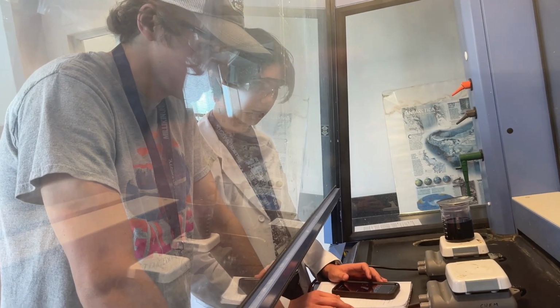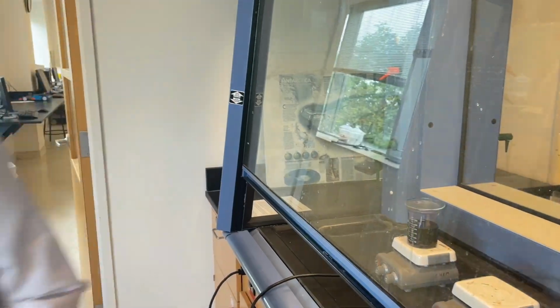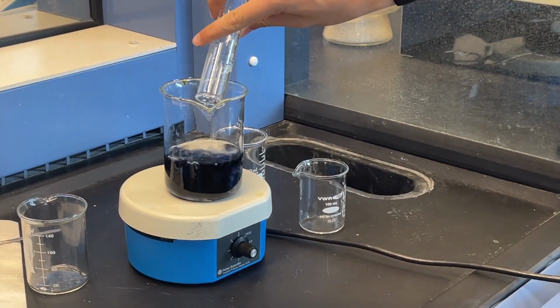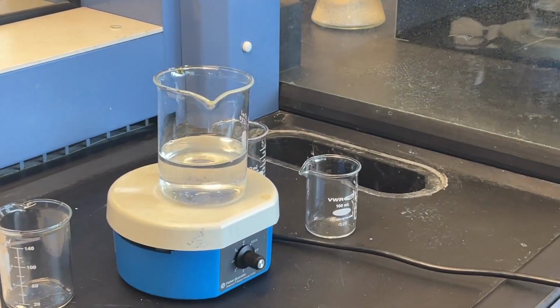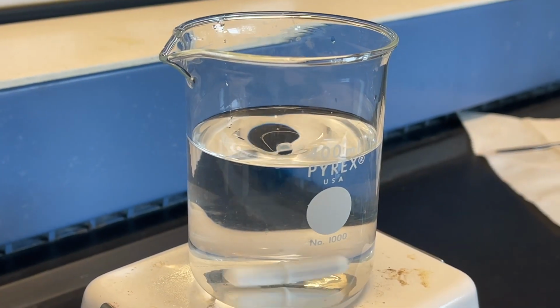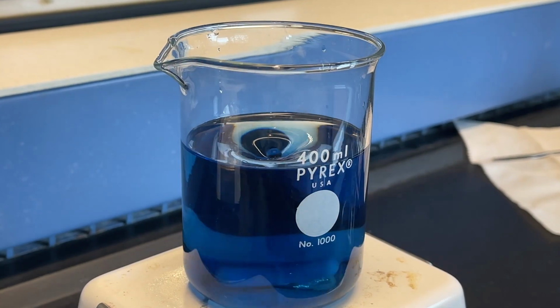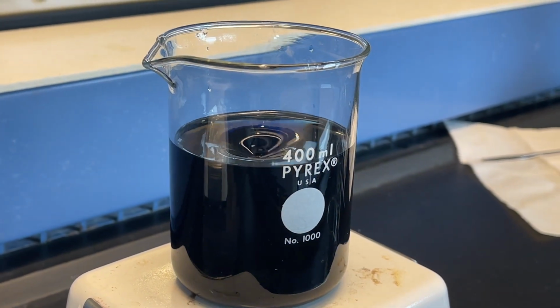So the second project that the two young men are working on, they wanted to work on a clock reaction, and clock reactions are ones that change color in different times depending on the reactions that are set up. So they chose to work on a greener clock reaction, so that means it doesn't have much hazardous waste involved. So they can do it repeatedly, and then they want to time their clock reaction changes with music. So they've been working on it, pretty dedicated, concentrated effort on that project for a while.